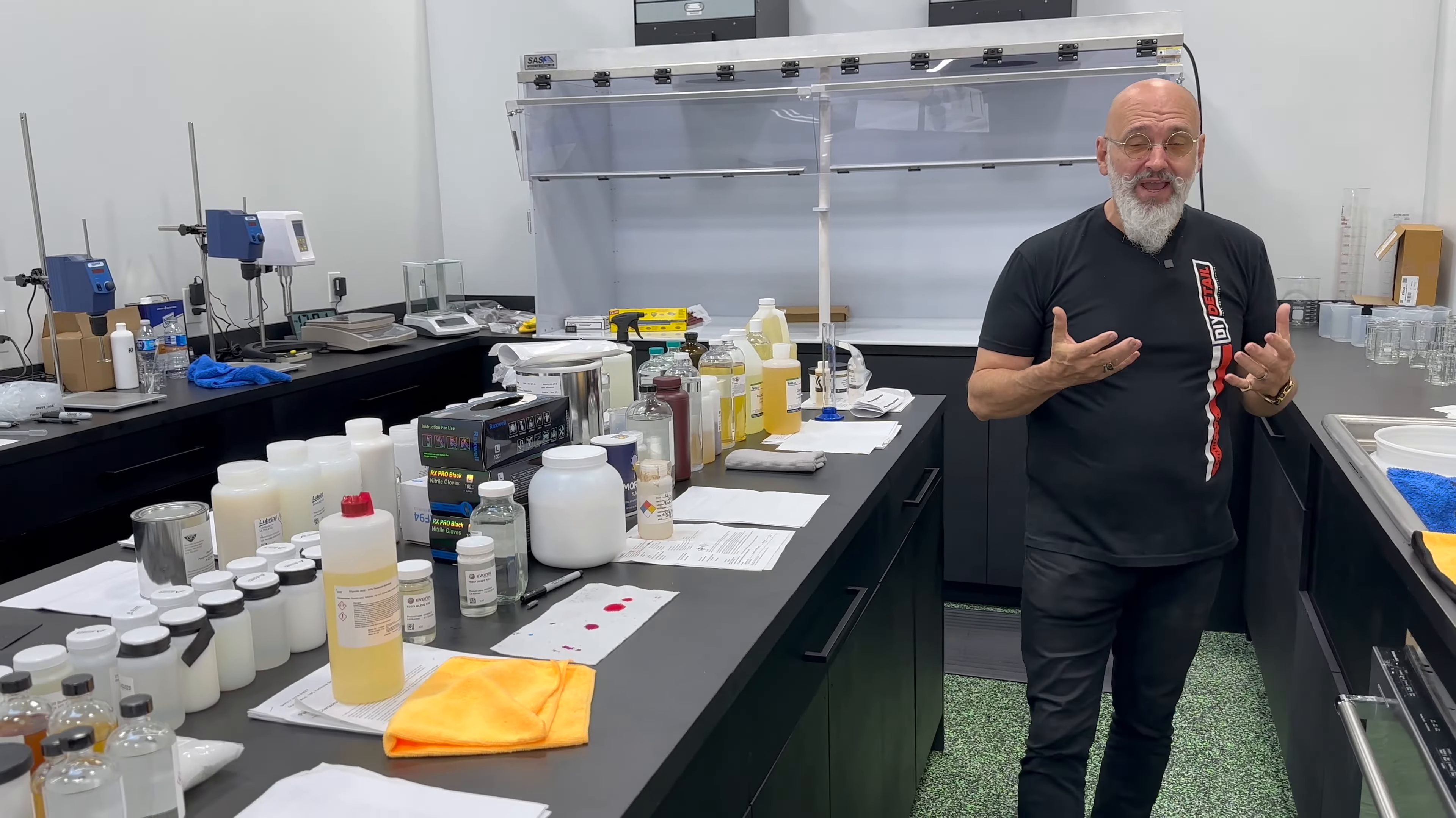This is where the mixing actually happens. This is a vent hood. That way, when the chemist is working, he's not getting any fumes, he's not breathing anything. And if there is a chemical reaction, this door closes very quickly. There's fire extinguishers in there. So a very safe process.